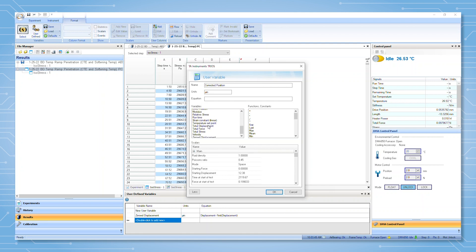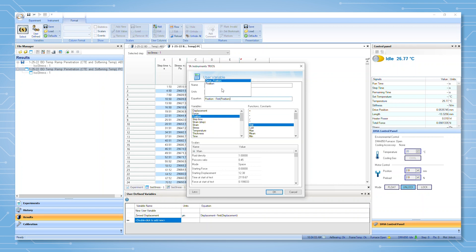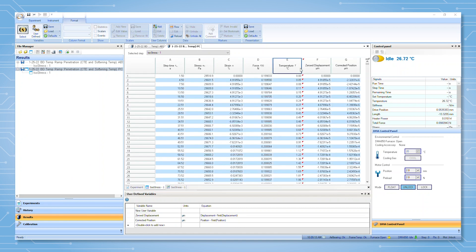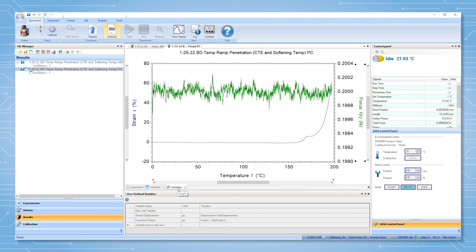From the list of predefined variables, user-defined scalars, and functions and constants, the user can build a unique equation for their individual analysis needs. Here, I built a simple function to subtract the initial gap from the current gap, but the functionality allows for much richer functions.